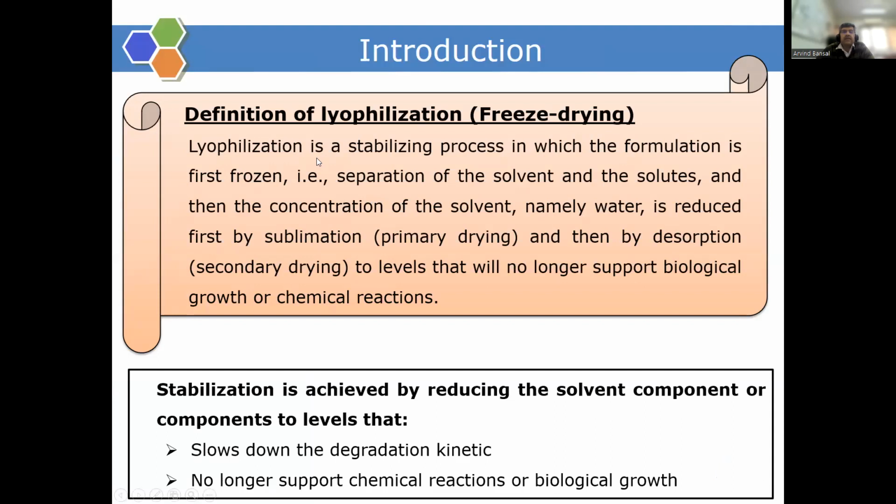Lyophilization is defined as a stabilizing process in which the formulation is first frozen, that is, separation of solvents and solutes, and then the concentration of the solvent, namely water, is reduced first by sublimation, that is the process of primary drying, and then by desorption during secondary drying, to levels that will no longer support biological growth or chemical reactions.